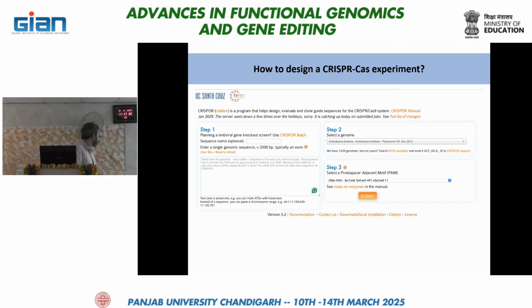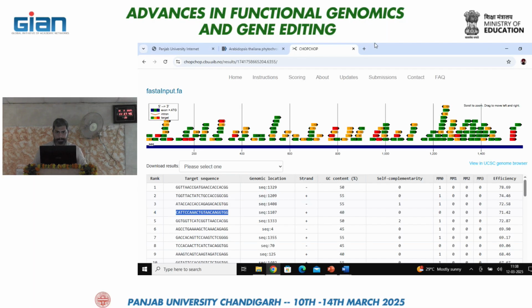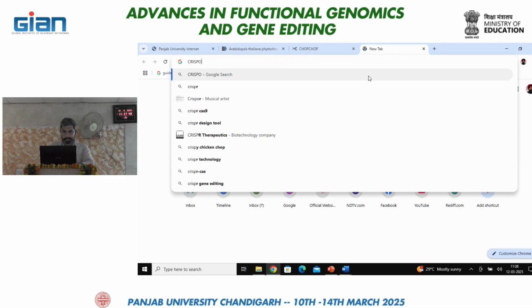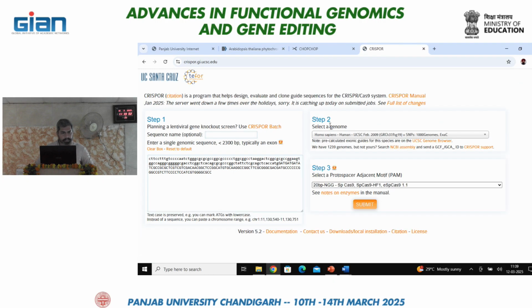This is CRISPOR. You can just search CRISPOR. You have to select this one, UCSC one, I think. Yes.